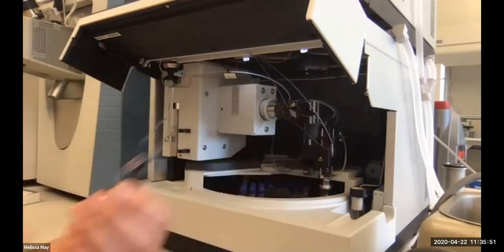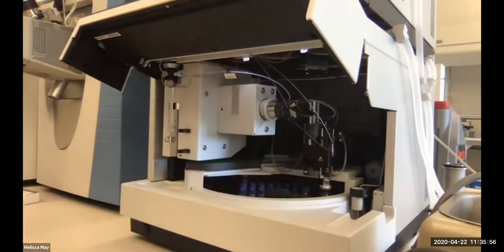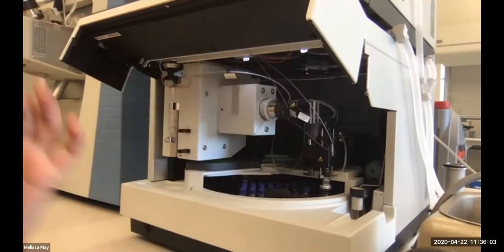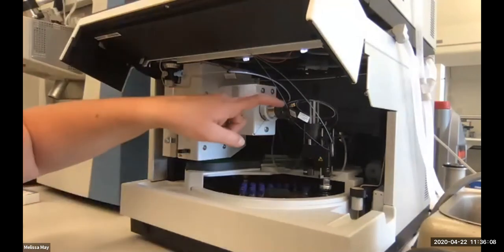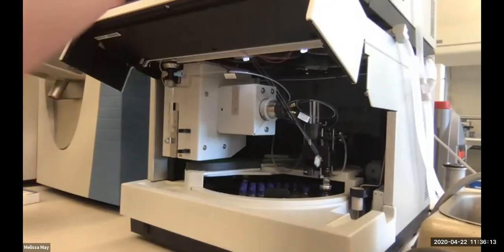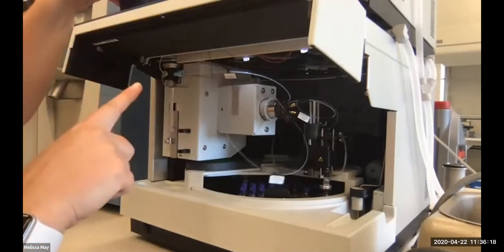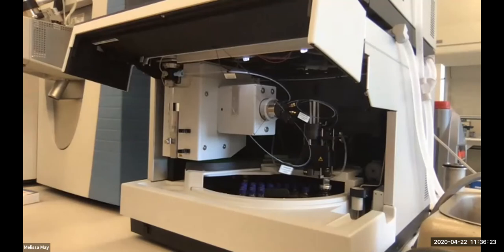And the column loops look something like this, right? So there's various different sizes. This one is a 20 microliter loop. We also have 1 microliter loops. The one that's on there right now, I believe is also a 20 microliter loop. Okay, so that means the 20 microliters fits in that. We have a line, this one, that is going, let's double check that it's going the right way, up into our column, which we'll talk about. And then we have another one that's bringing loading buffer down from our loading pump.